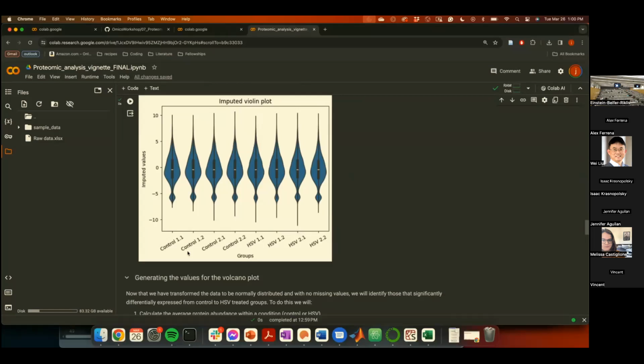Is it clear for everybody why we impute values by moving 2 standard deviations to the left of the distribution? Right, so as Juan said, these data are positive log skewed, which means that if you take the logarithm of this data, you're looking at normally distributed data. And normally distributed data have a specific property, a width that is a number of standard deviations.